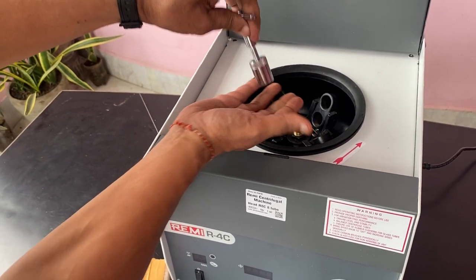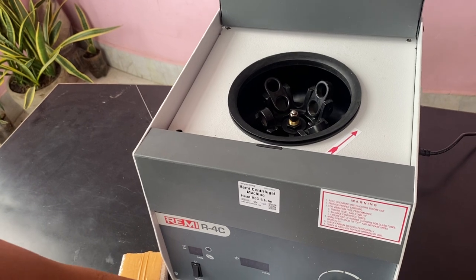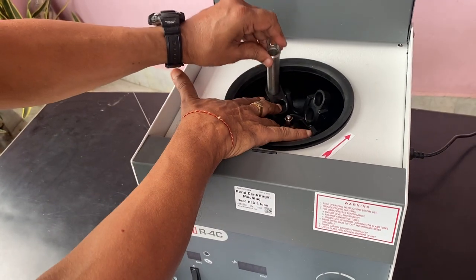Open this section, then load it and tighten it. This head comes out and you can change it. It has a capacity of eight tubes.